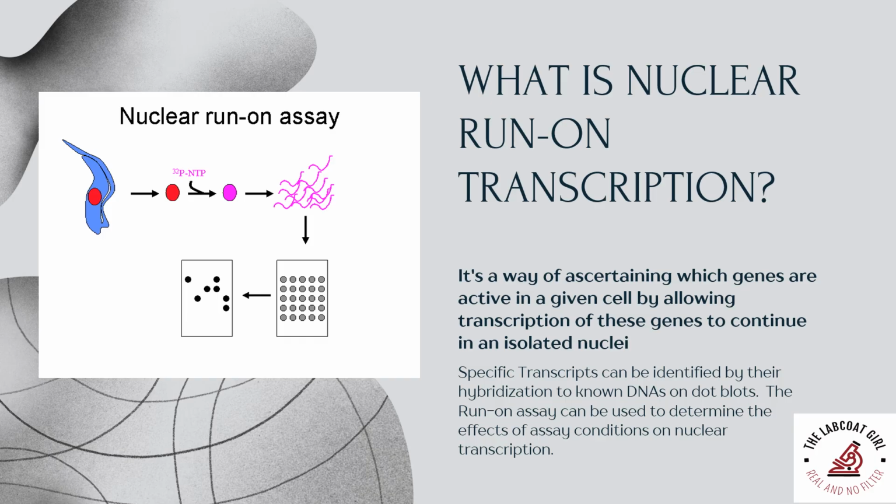Now there is a shift. When the nuclei was inside the cell, it was an in vivo situation. And now the nuclei is outside the cell, and whatever you're going to do is outside the cell, which means the condition is in vitro. Now in vitro, you have to allow that transcription to happen. The initiation had already begun when the nuclei was inside the cell. And now in the next step, you're allowing the elongation of that strand with the help of RNA polymerase in the in vitro situation. Cool.